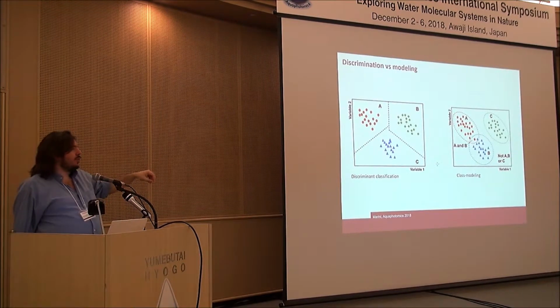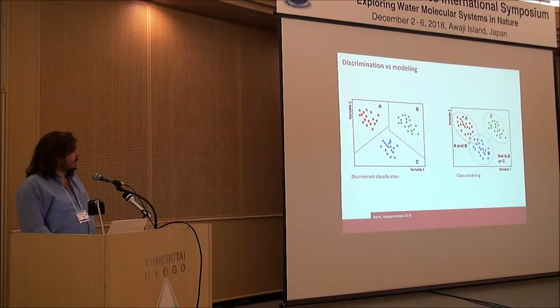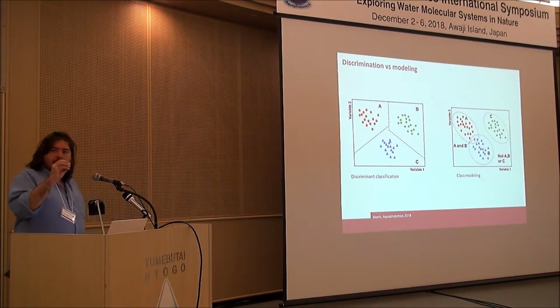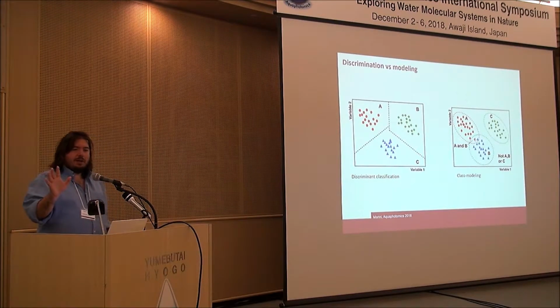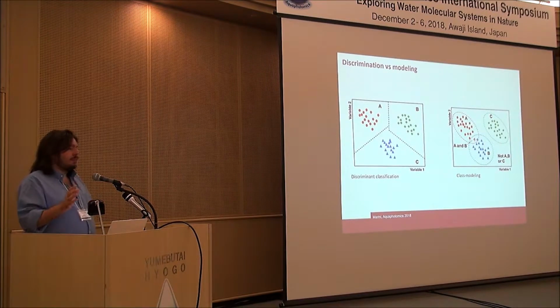And then it may fall in the regions of space where I have only class A, for instance here, yes, you see it. It can fall on the region of space where I have only class B, but it can fall here. And here I have the additional information that that particular sample may either be A or B. So it's in a position where my decision could be blurry, or anyway, it could have a high enough degree of likelihood to be from one part and from the other.